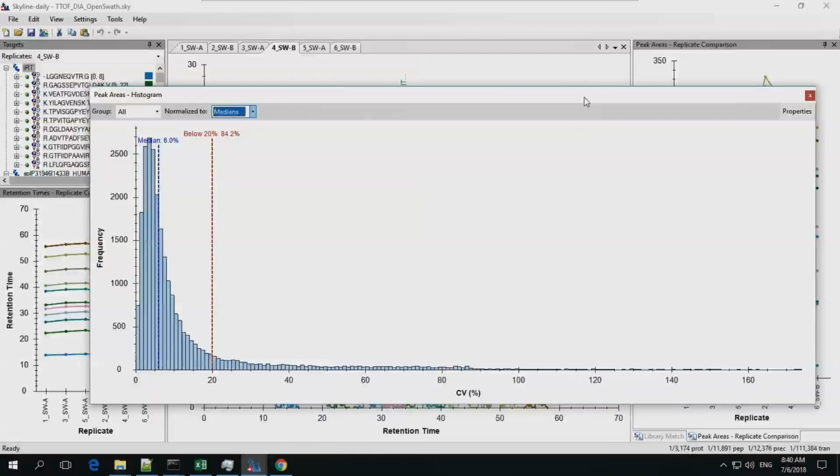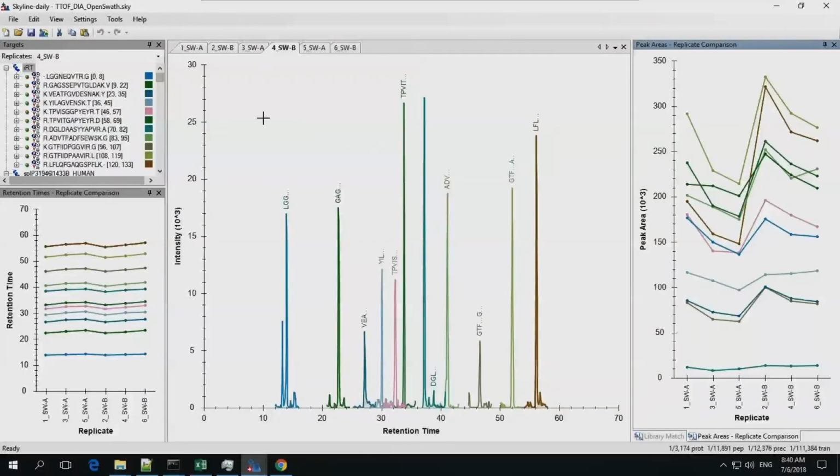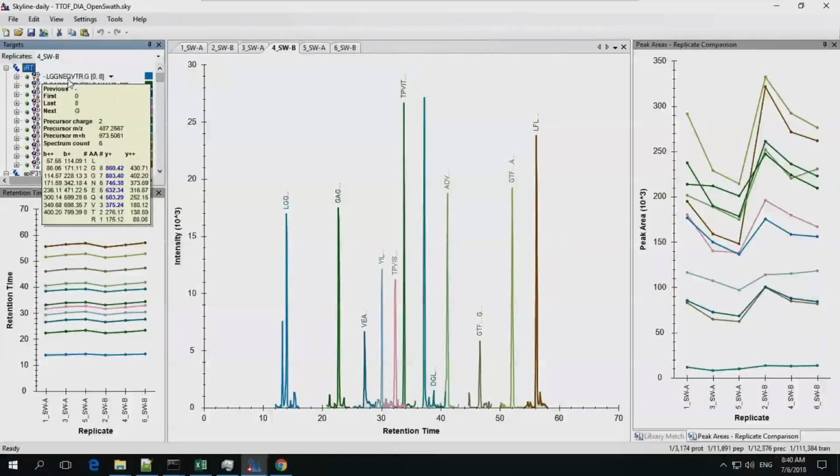I have to say, there are data sets that I teach where I really have looked at them a lot, and I have a lot more to say about them, but I'm just looking at this with you and learning what I can learn just from looking at Skyline. And we're not even really digging in as much to getting a sense of what's happening on the chromatogram level. We did one little thing of why is this DGL getting picked incorrectly? But you can't possibly look at all 100,000 chromatograms here, but you can definitely get a sense of your data more if you're actually looking at the chromatogram level.